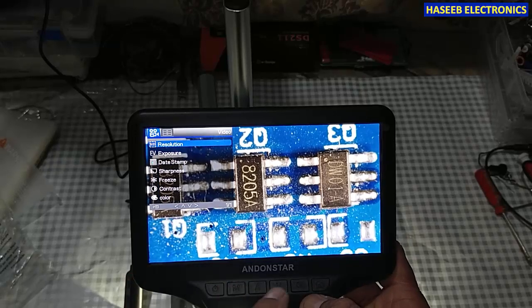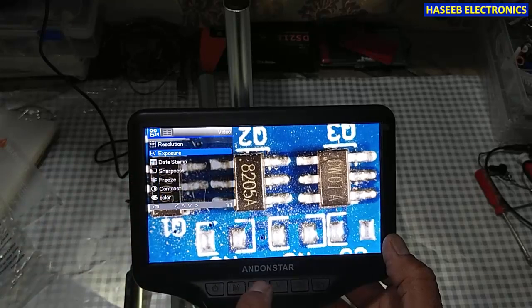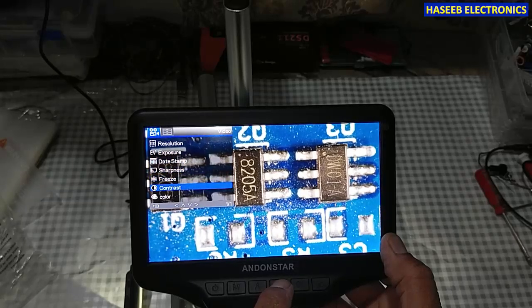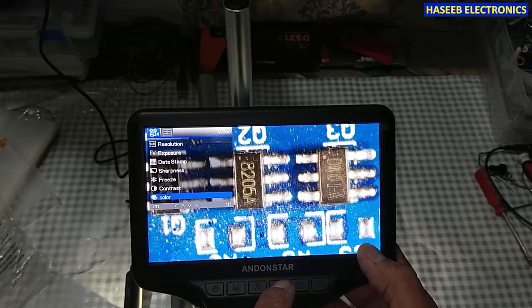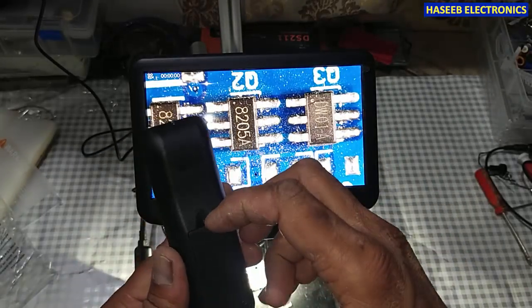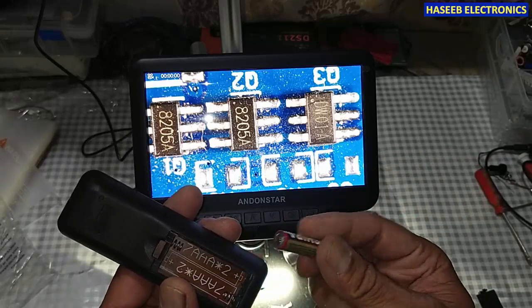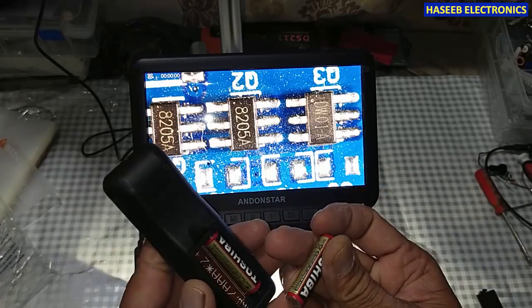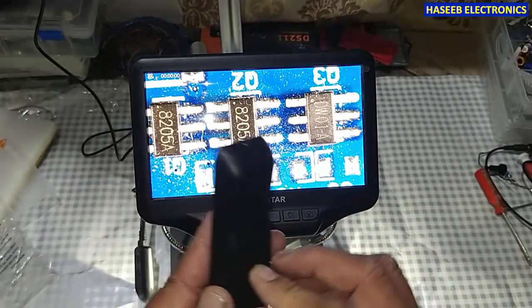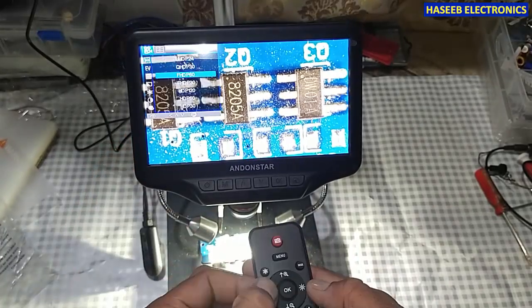In the menu there is also exposure setting, date stamp, sharpness, freeze, contrast, and color. We can also use the provided remote control — just open the battery cover and install two triple-A 1.5-volt batteries, which are normally used for remote controls.